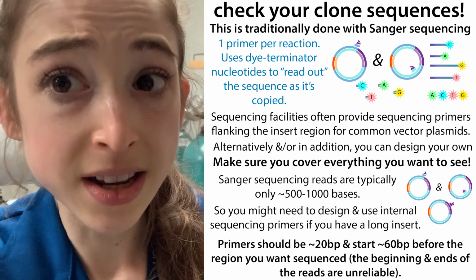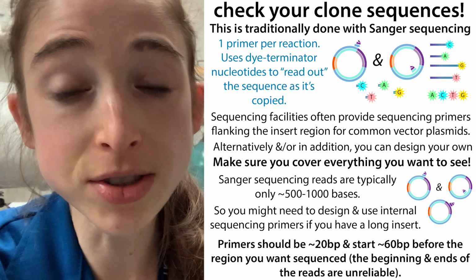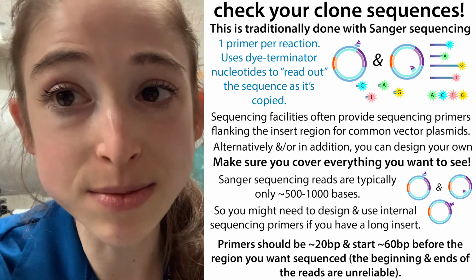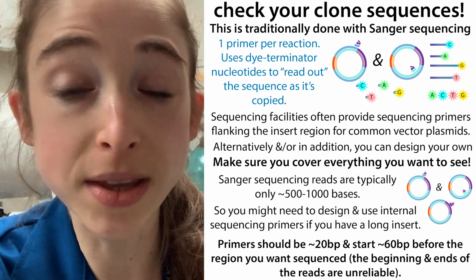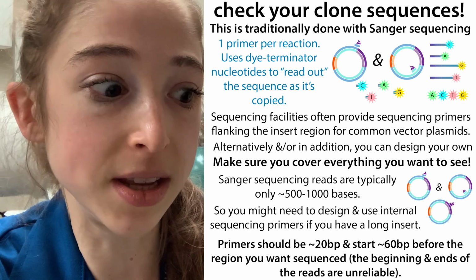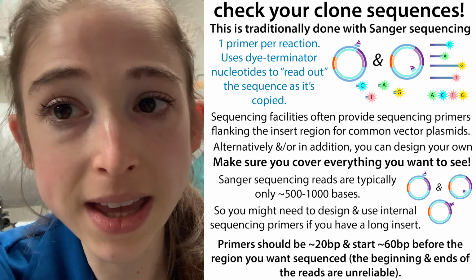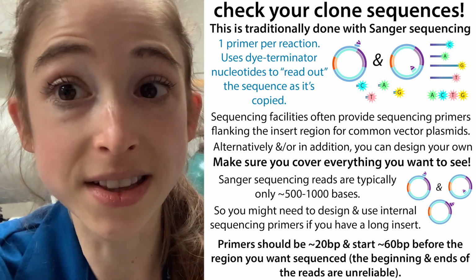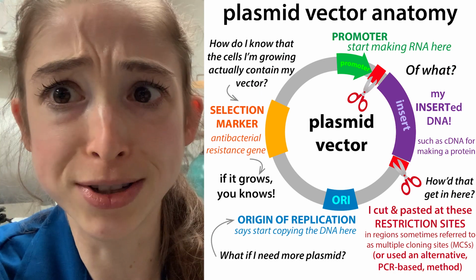Have you sequenced your plasmids? If not, stop what you're doing right now and go sequence them. Okay, maybe don't stop what you're doing right now, but you shouldn't be doing any work with a plasmid until you've verified its sequence. This could be something you just cloned, something you ordered from a company, or something your lab mate gave you, but anytime you get a plasmid, you want to verify that the sequence is what you think it is, and even that the insert is what you think it is.